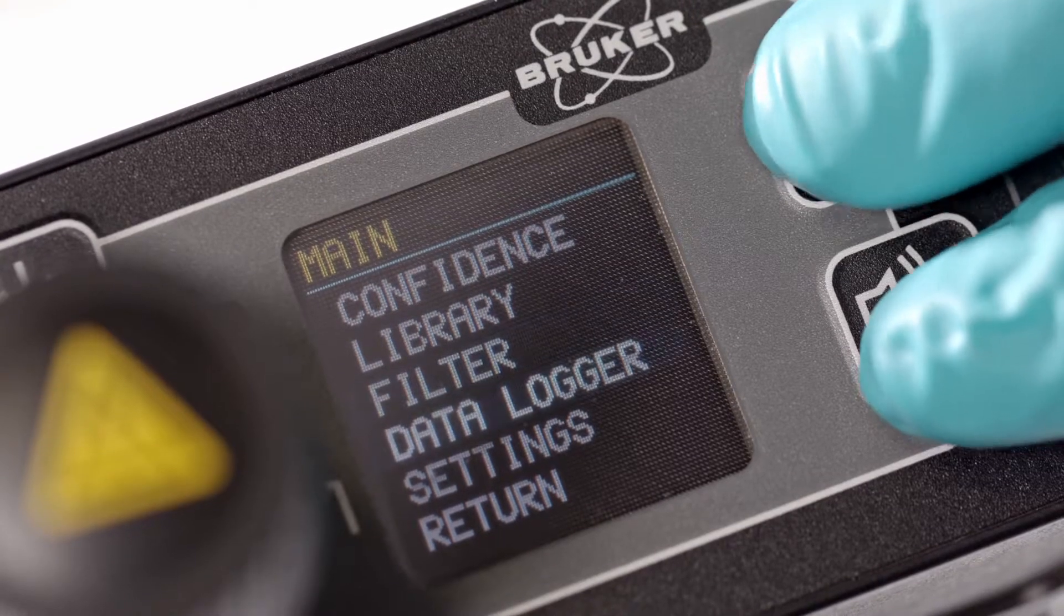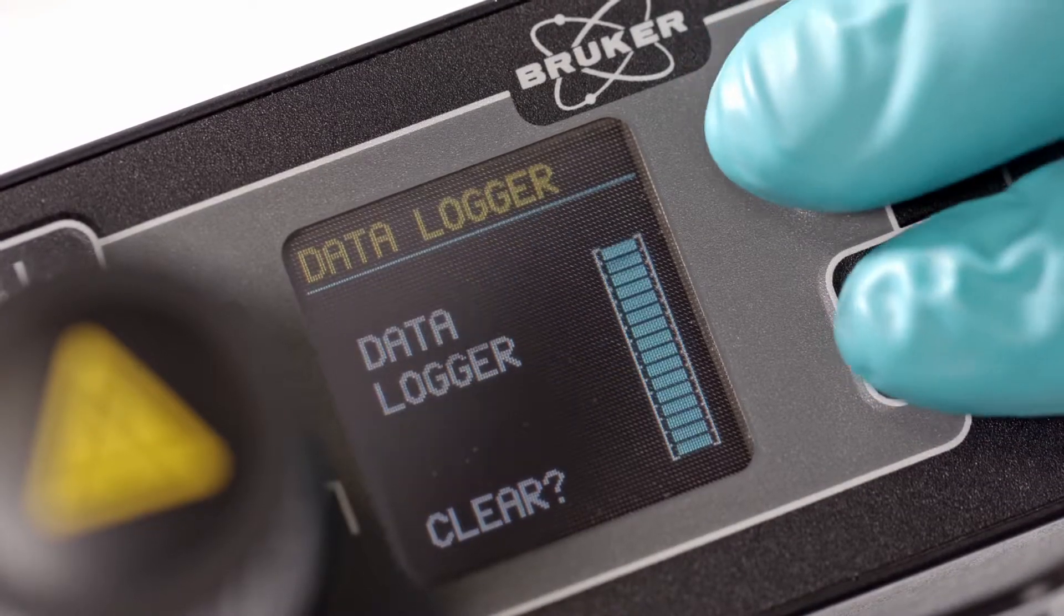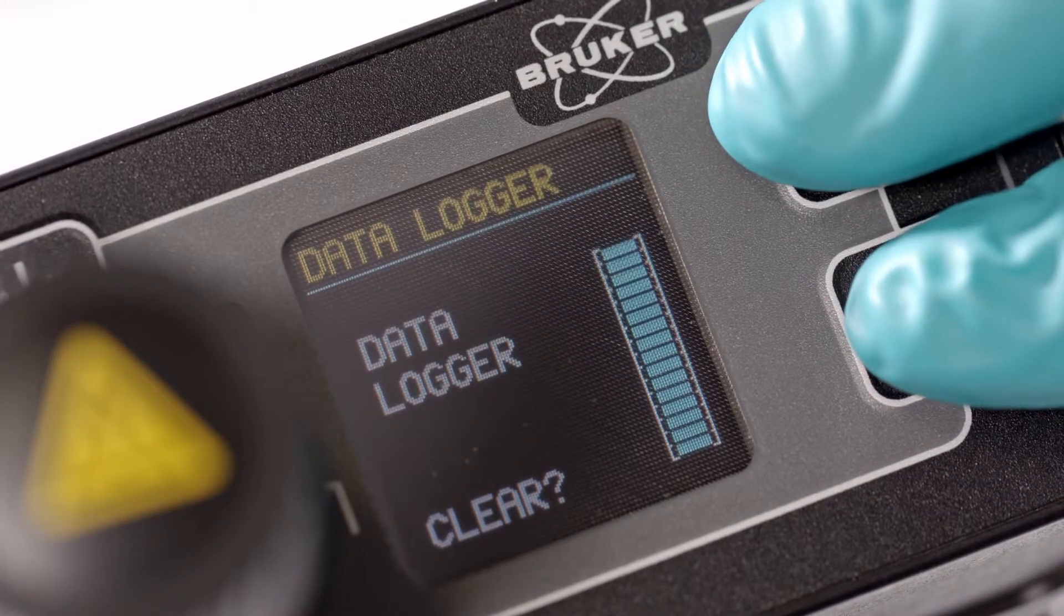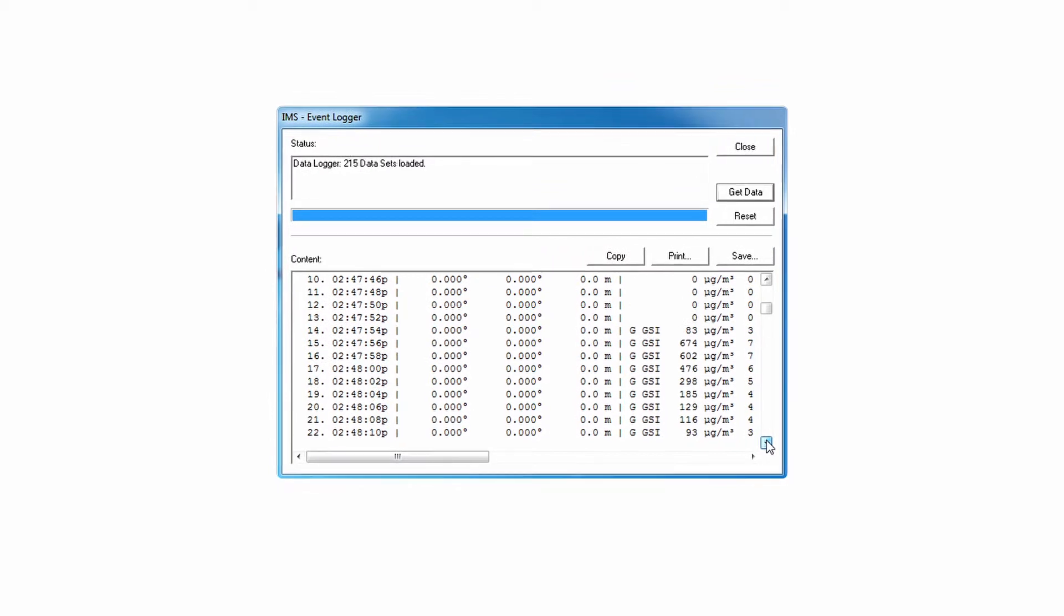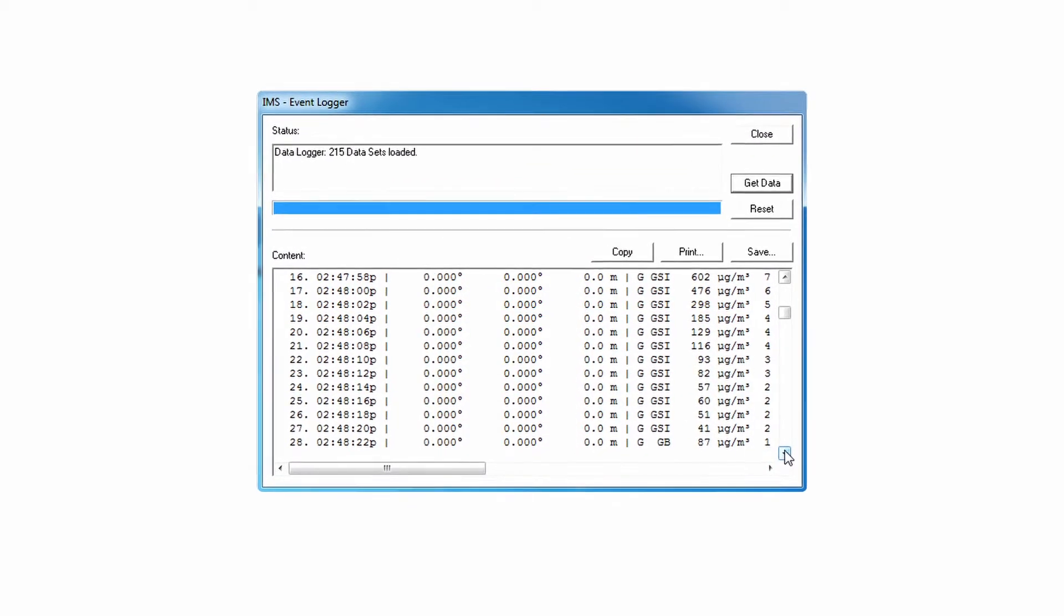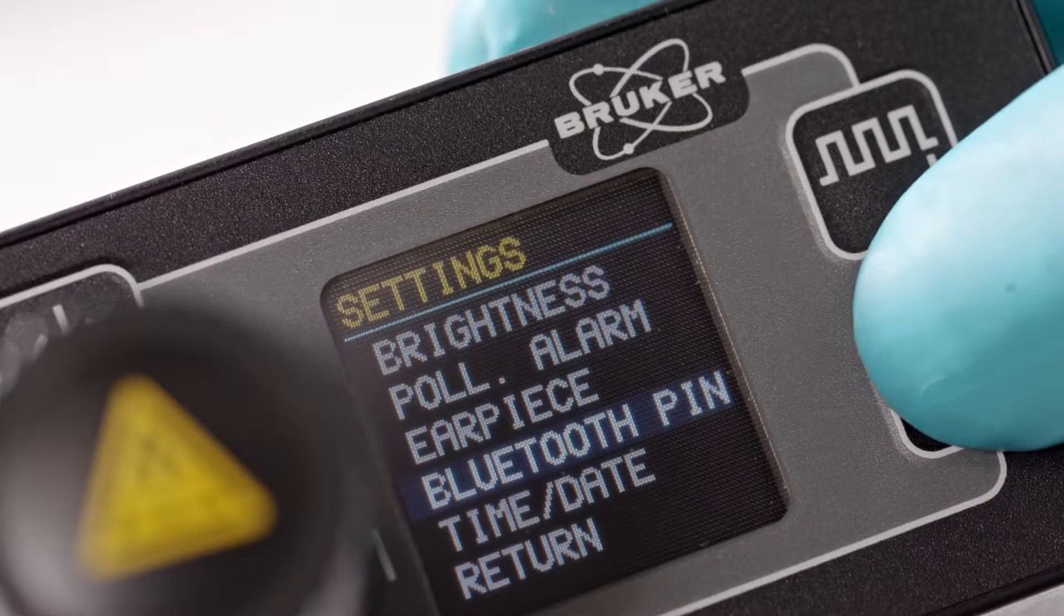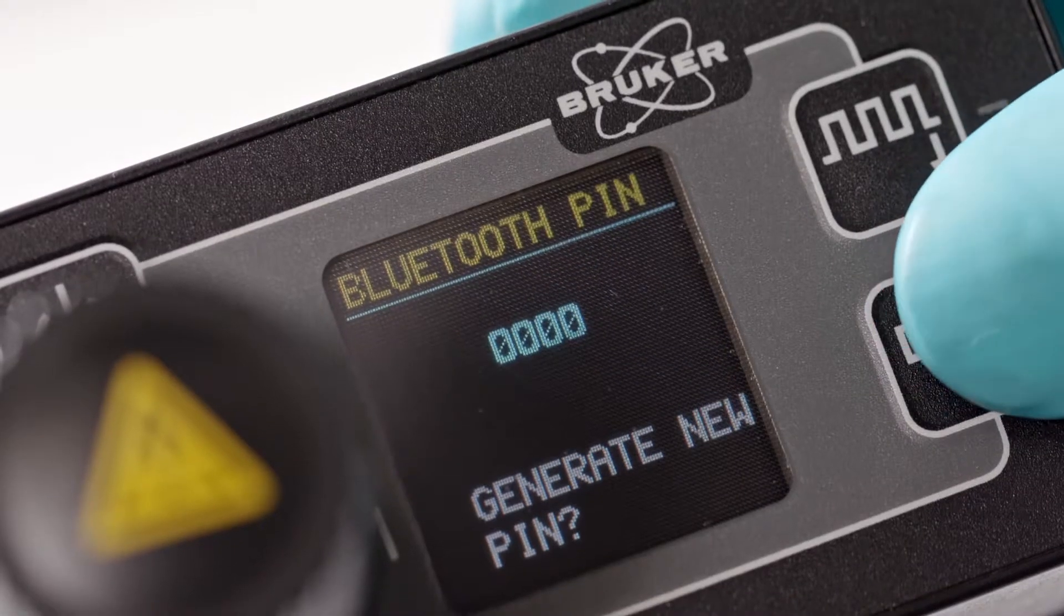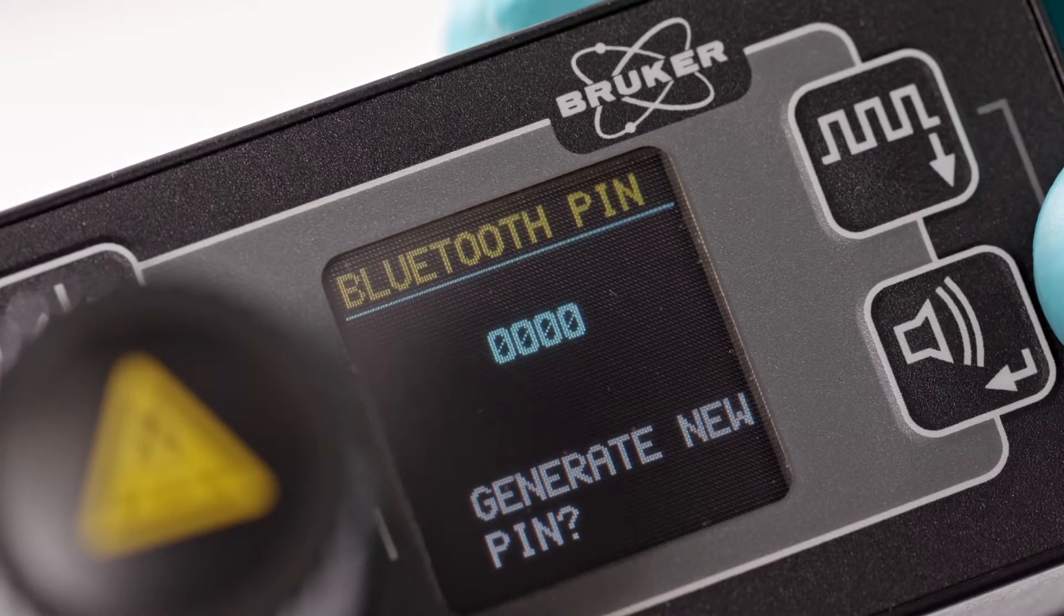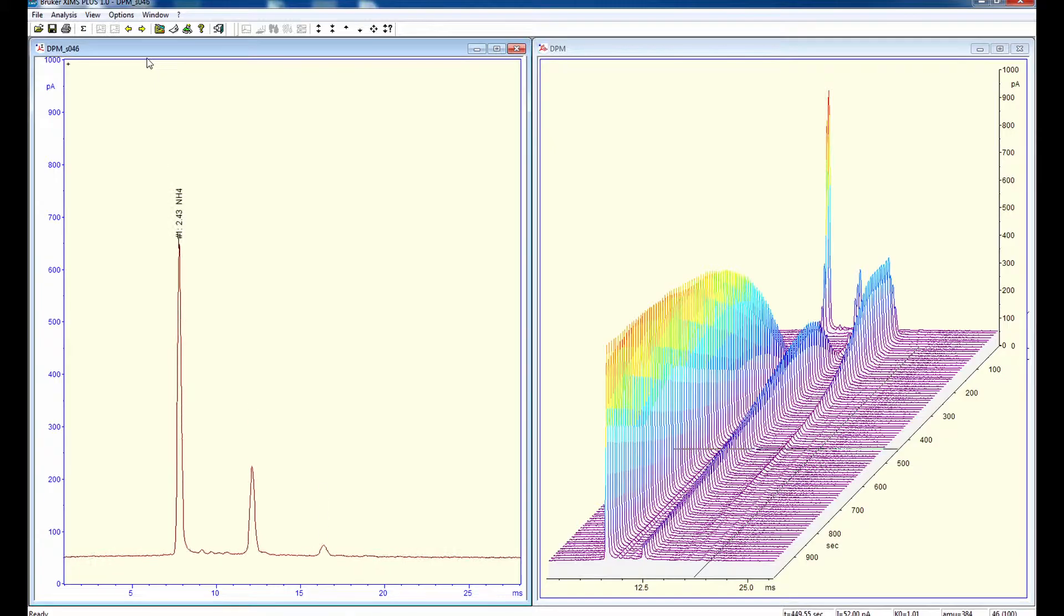All measurements taken by MicroRAID Plus are stored in an internal data logger, which can be downloaded post-deployment using complementary Windows-compatible software. A Bluetooth option is also available.